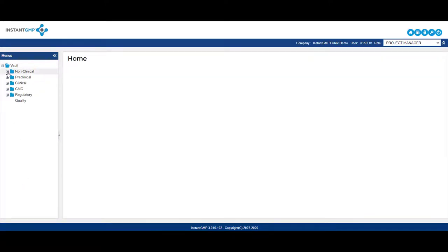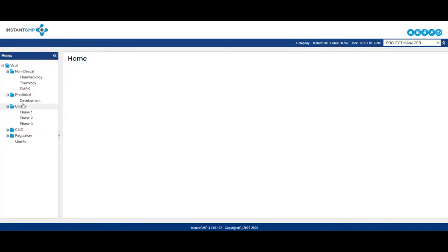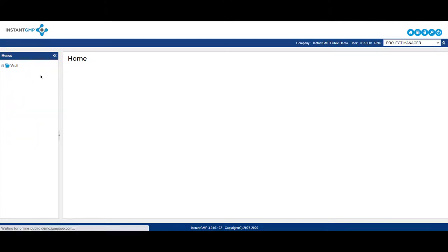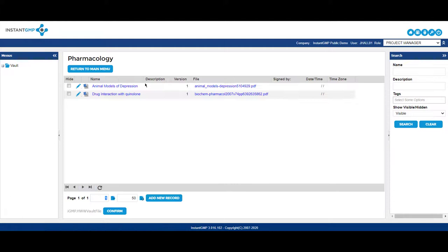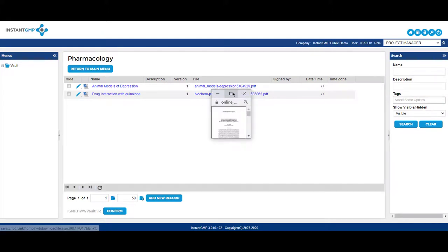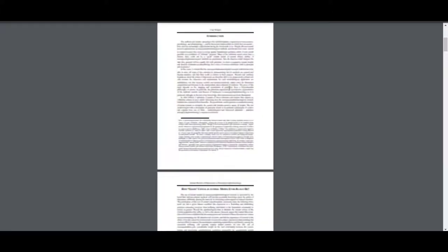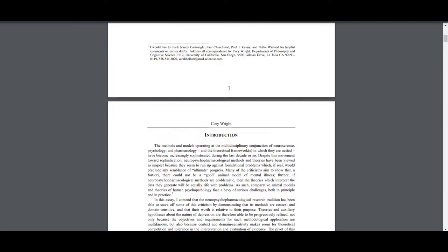One of Instant GMP's latest features, the Vault, allows end users to store key documentation within their instance. The Vault allows you to create folders and store your documents in a cloud-based system for access anywhere on and off-site.